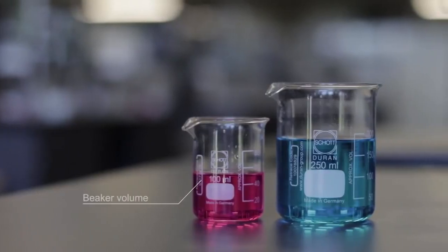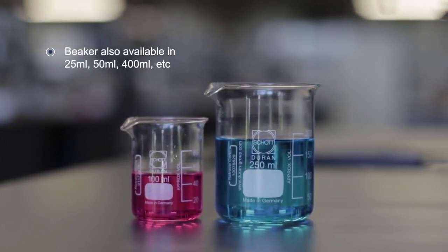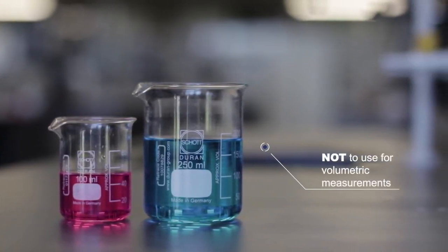A beaker has a cylindrical shape with a flat bottom and is available in a wide range of sizes. A beaker is used for stirring, mixing, or heating liquids and is not used for precise measurements.